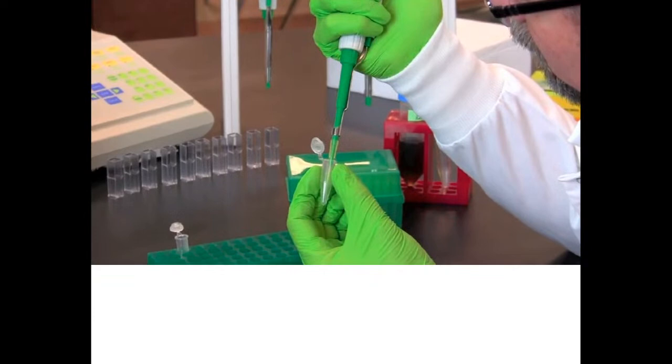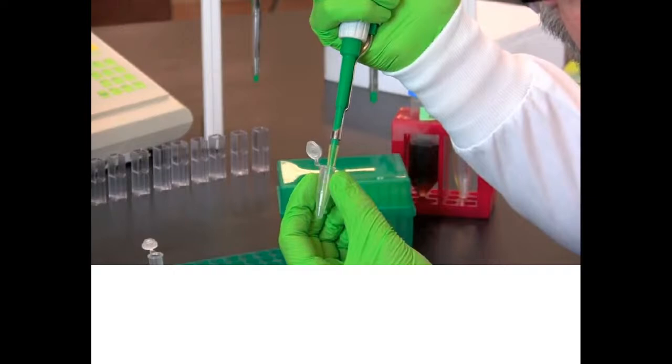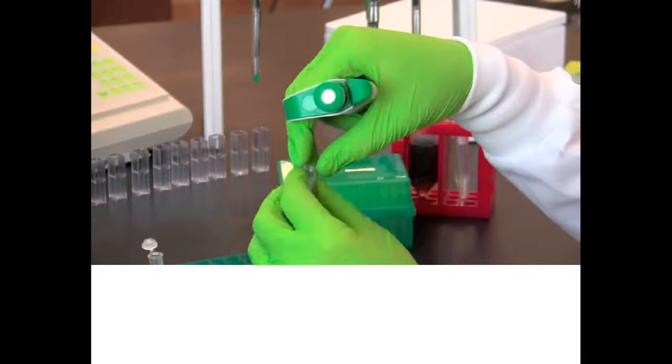Mix the milk sample and PBS by either pipetting or vortexing. This mixture has diluted the milk to 1 part in 50. Label 2 cuvettes, one control and the other sample. Do not handle the cuvette where the light passes through, and make certain your labels are well above this area.